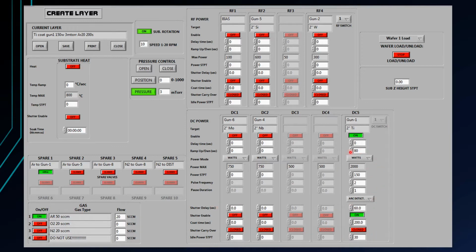One thing that's kind of important to know about the relationship between this ramping up and down is that if your ramp time is, say, 80 seconds, and your power set point was, let's say 150, if your idle power were 149, it will ramp from 150 to 149 over 80 seconds. So it doesn't actually care what the difference in power settings are. It just knows there's a difference in power, and here is the amount of ramp time I'm supposed to use to go from one power to the next power.